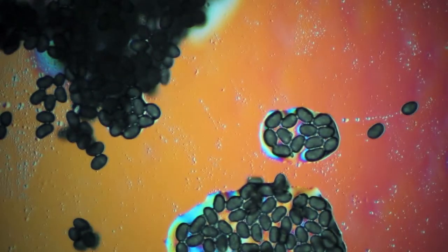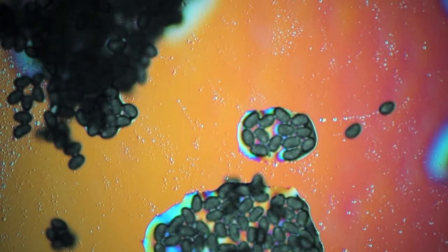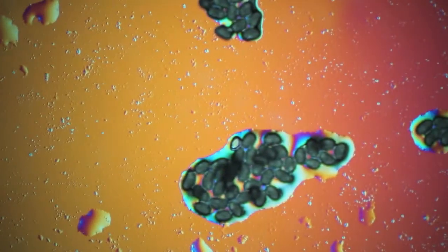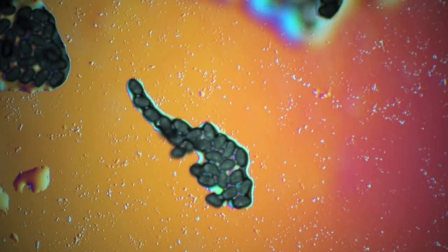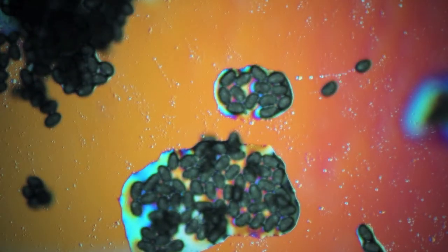So we're going to move over here. Sorry it's moving so fast. But I want to find a field of view of individual grains that are laying out kind of like that, so you can see each one individually. And so we've got a couple of areas here, such as these, with a few pollen grains laid out that we can examine. And what we're really interested in is this internal feature of the grains moving around. Well, the products inside the grain, which we don't know what they are, moving around.